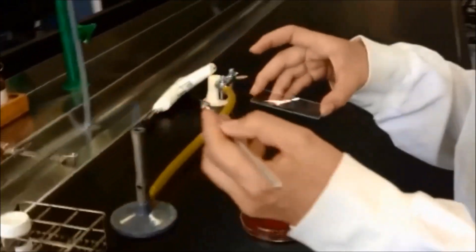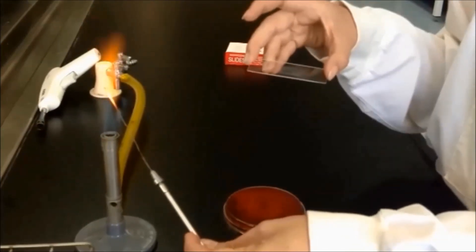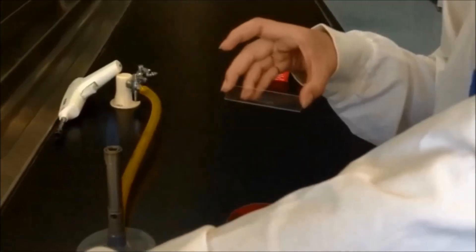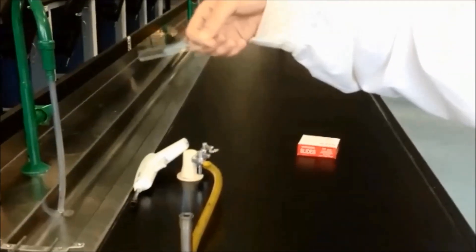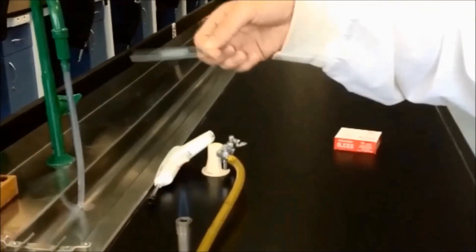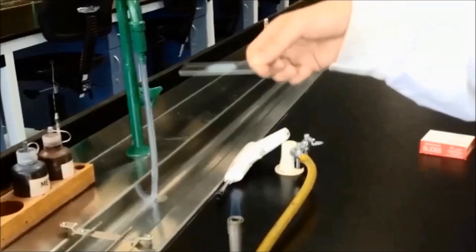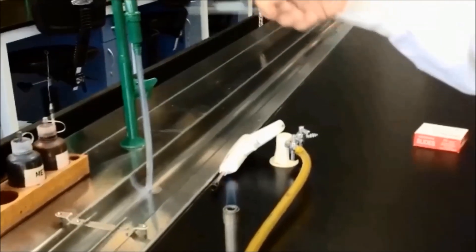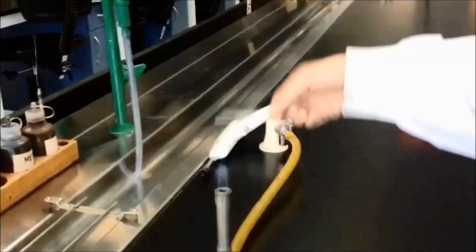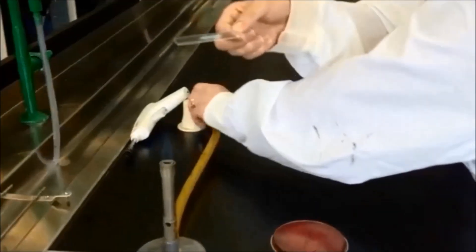Once again sterilize the loop. Dry the slide above the Bunsen burner flame and fix the smear in the same manner as before. You are now ready to Gram stain your fixed smears of bacteria.